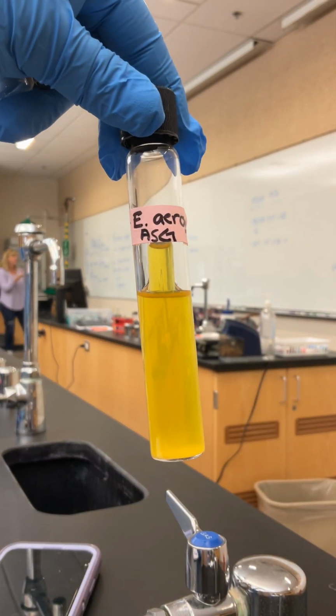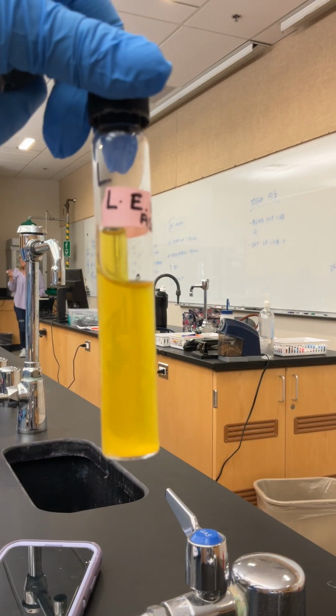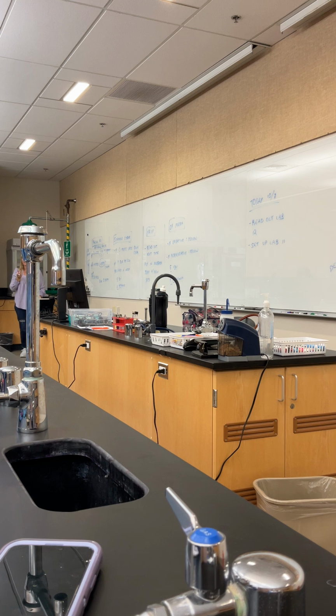Now you might notice that Proteus looks a little orangey. That's okay, but he's still not a pure yellow. We are looking for red or yellow. So what that's telling us is he's making a little acid, but not enough to give me a strong positive. So E. aerogenes should be positive, Proteus vulgaris should be negative.